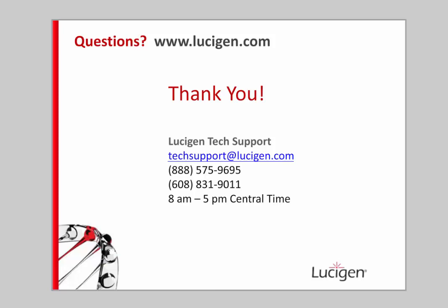Karen? Okay, thank you, Beth. And so audience, please use your chat window on the left if you have questions for Beth. We'll take questions now. In the meantime, we have a question from Husta regarding whether the protein of interest really remains soluble after cleaving off the SUMO tag or any other solubility tag.